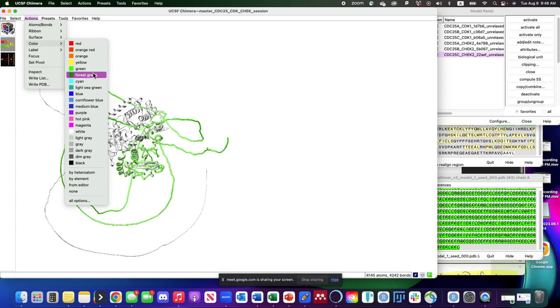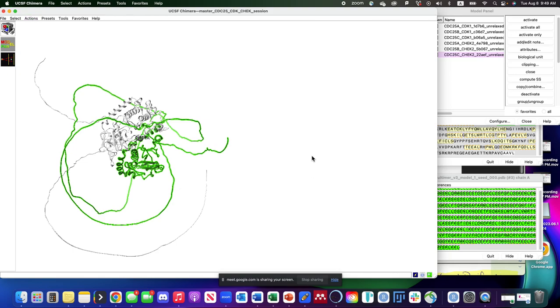That's one thing we have to be mindful of in publications, choosing colors that are colorblind friendly. So that's like green and magenta, or purple and orange, or yellow and blue. Those are all colorblind friendly combinations.